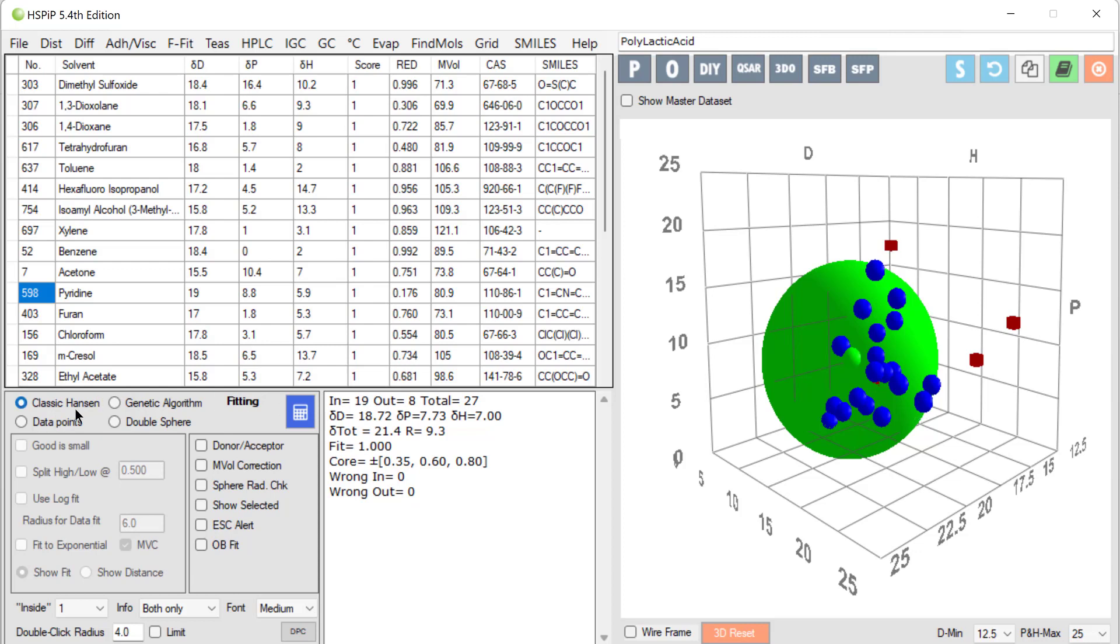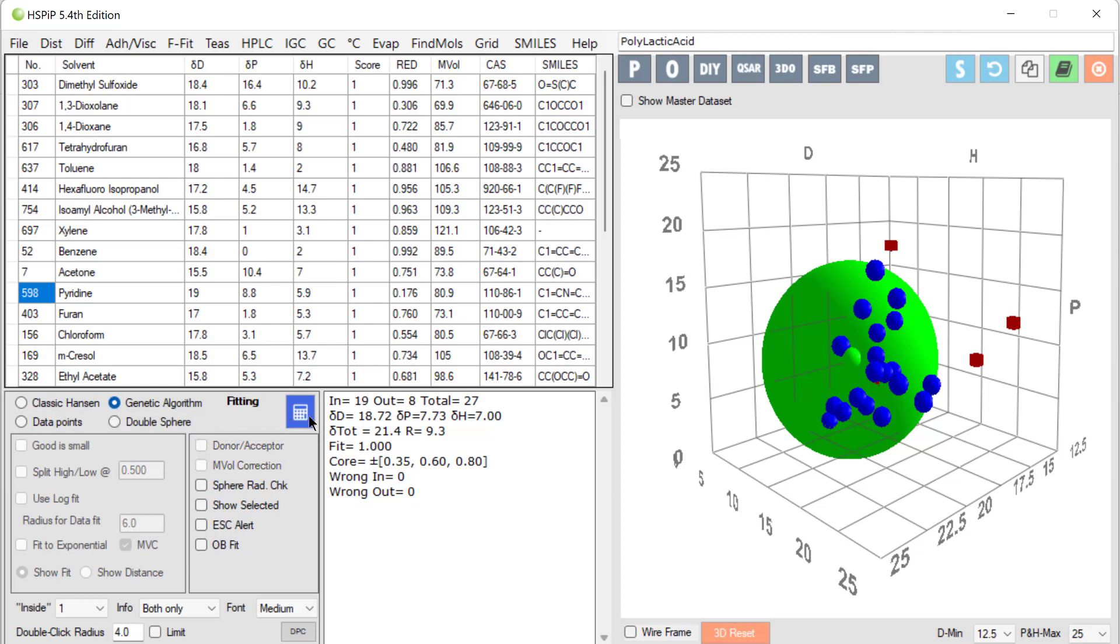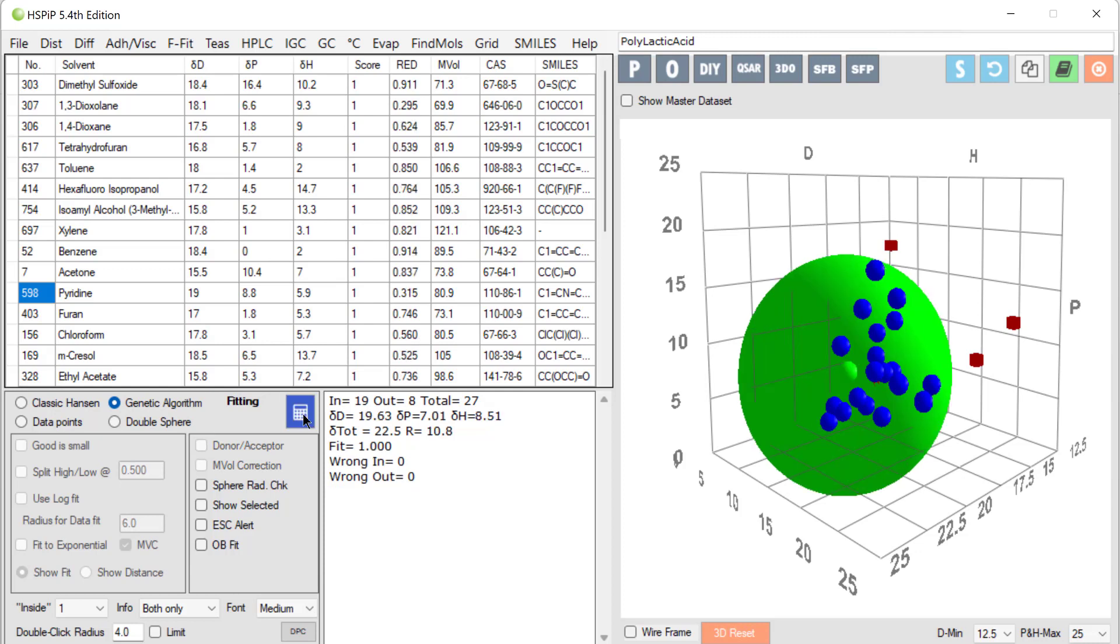I fitted this with the classic Hansen fit. I can also choose to use a genetic algorithm. So I click. This takes a bit longer. Here. And I get a different set of values. 19.6, 7, 8.5.